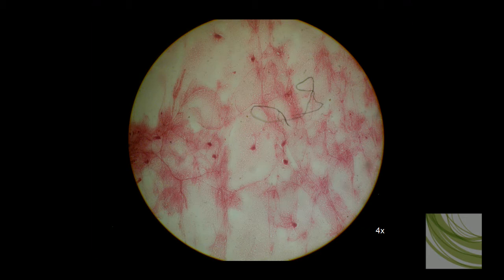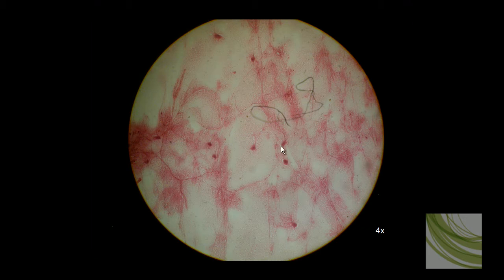Here we're looking at a different slide at 4x and we can see quite a few cell bodies. Now what's kind of good about this slide is you can actually see some things at 4x or lower magnification a lot better than you can at higher magnification.